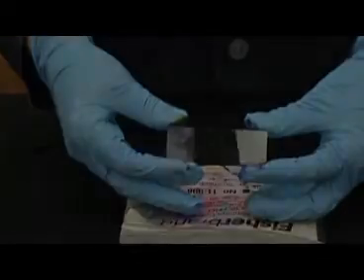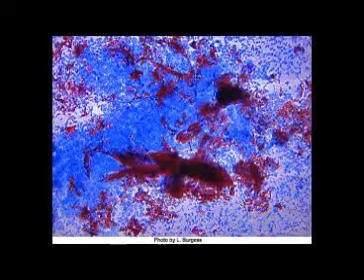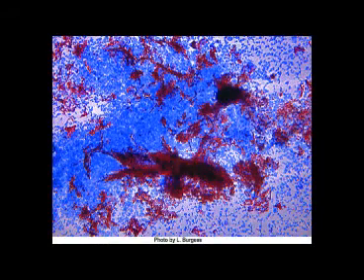After drying, the slide is now ready for observation under the microscope. Acid-fast positive cells will turn a bright fuchsia color, and acid-fast negative cells will turn a bright blue color. In this slide, Staphylococcus aureus is acid-fast negative. Mycobacterium smegmatis is acid-fast positive. The bright blue background of acid-fast negative cells gives strong contrast for the observation of acid-fast positive.